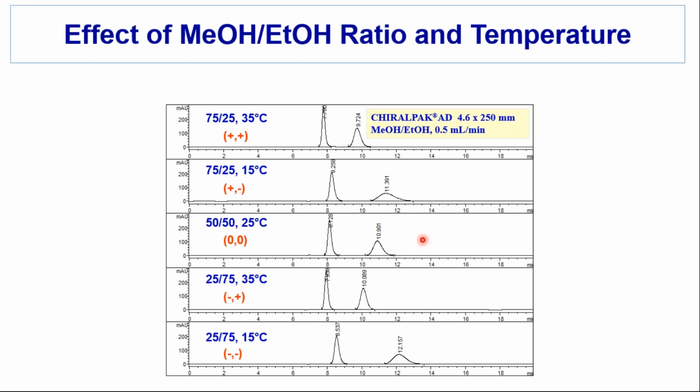Thought, well, let's see what happens as we increase the methanol-ethanol ratio. Let's see what the effect of temperature is. So this is a high level of methanol, ethanol, high temperature, low temperature, low level of methanol, ethanol, high temperature, low temperature. Simple factorial design, but you don't even need to plot the data. You can look at it. High temperature is going to give us better separation than lower temperature. And methanol and ethanol seem to have no effect. The ratio seems to not affect the separation very much.